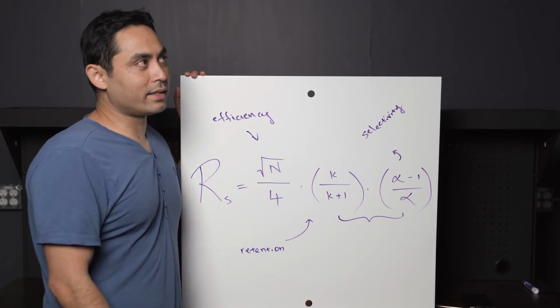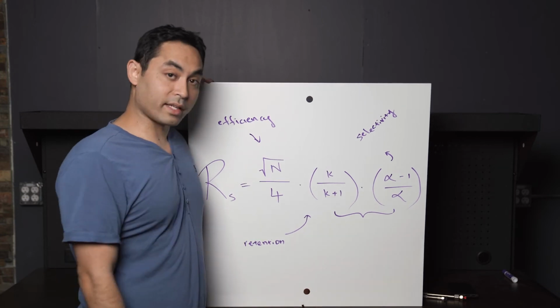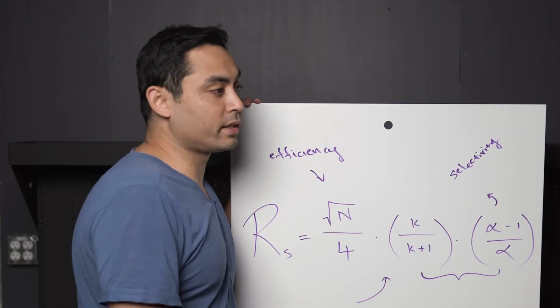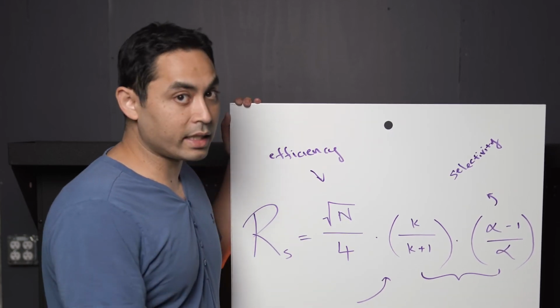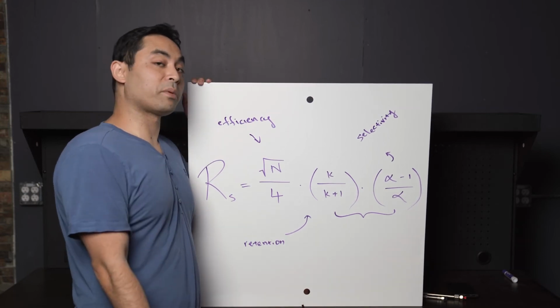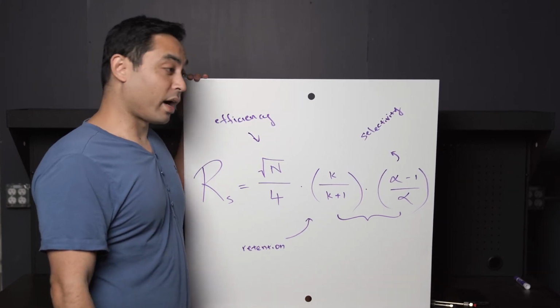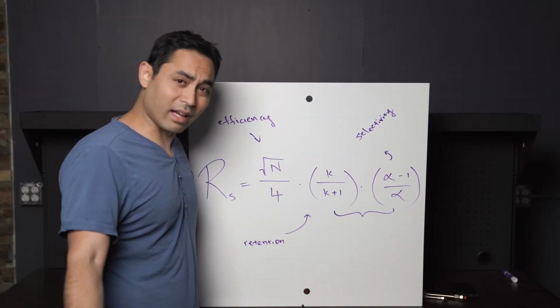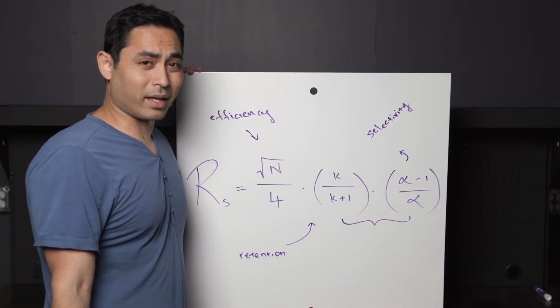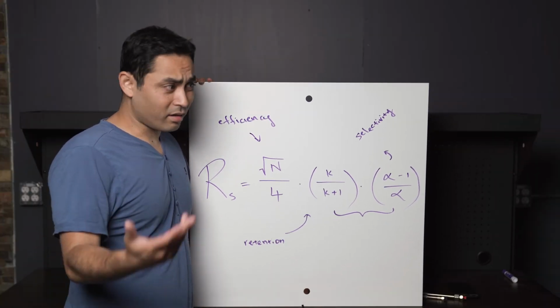The way that I look at it is, if you can do an application at lower pressure with a larger particle size column and you get that sucker running more often, HPLC applications are still quite good. And for the times that you absolutely need it, maybe it's the only way you can get a separation, or you really need the time, or you have really good sample prep, then UHPLC would be there. But for applications that require crazy high pressure, like 1,000 bar or above, we're talking about the super heavy duty instruments out there, I would say maybe 1% of people are actually doing that. The vast majority of people are running methods at lower pressures.